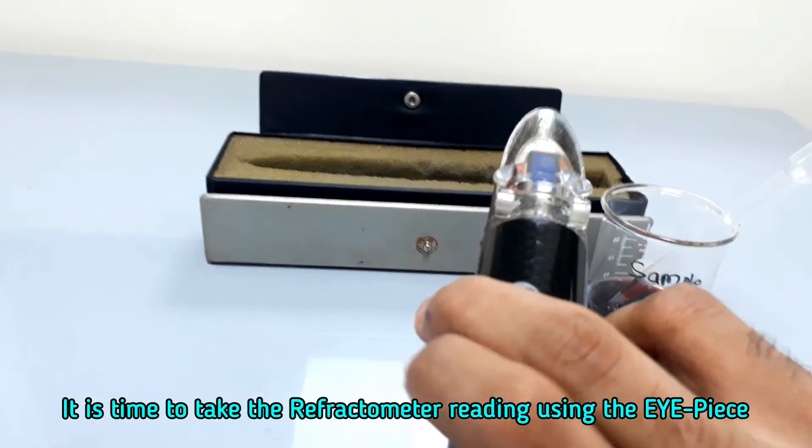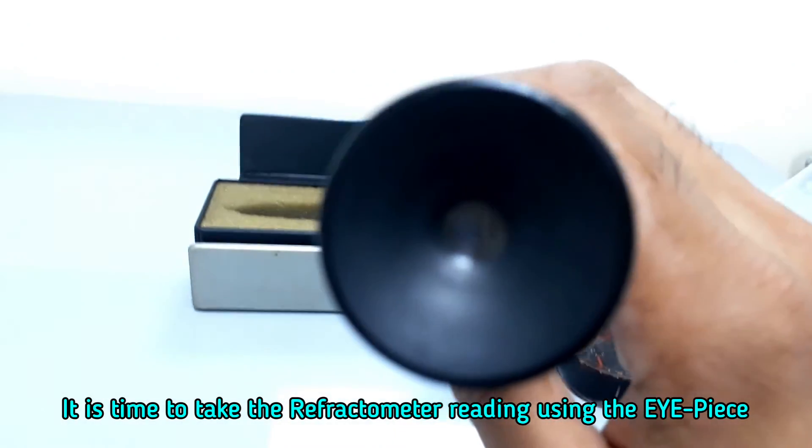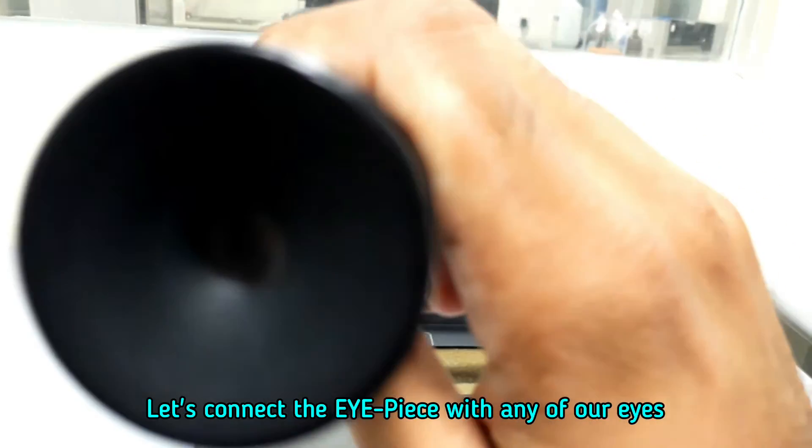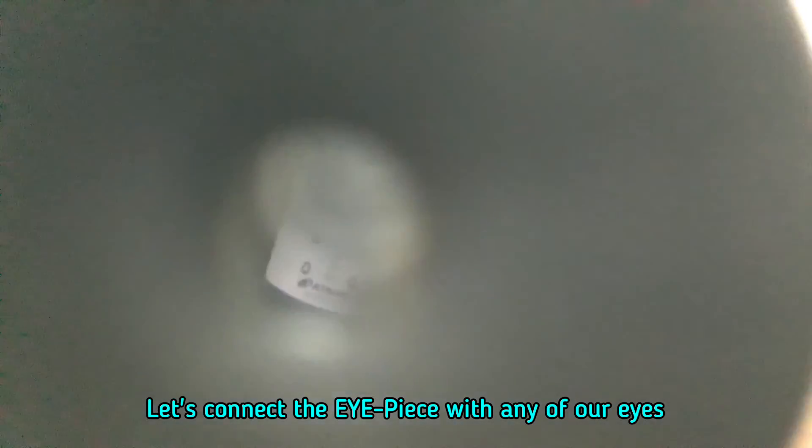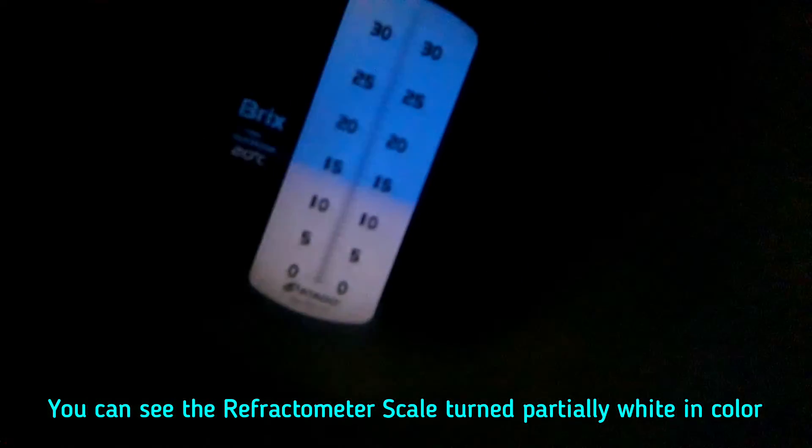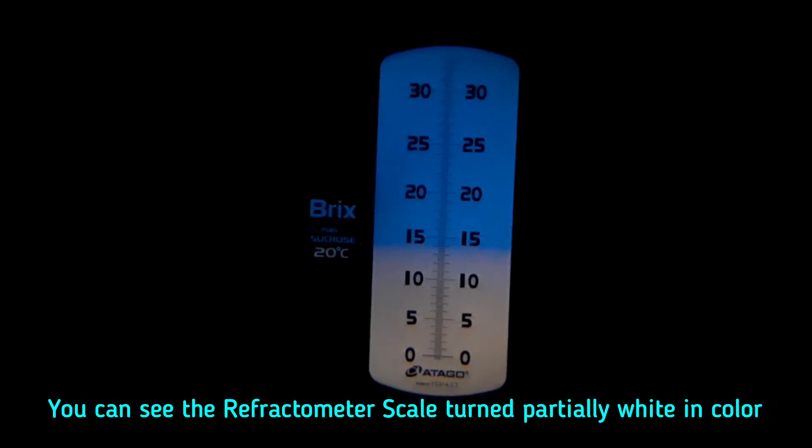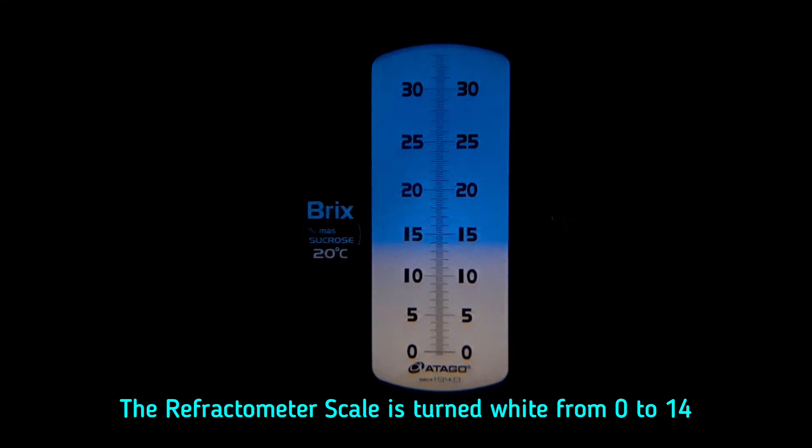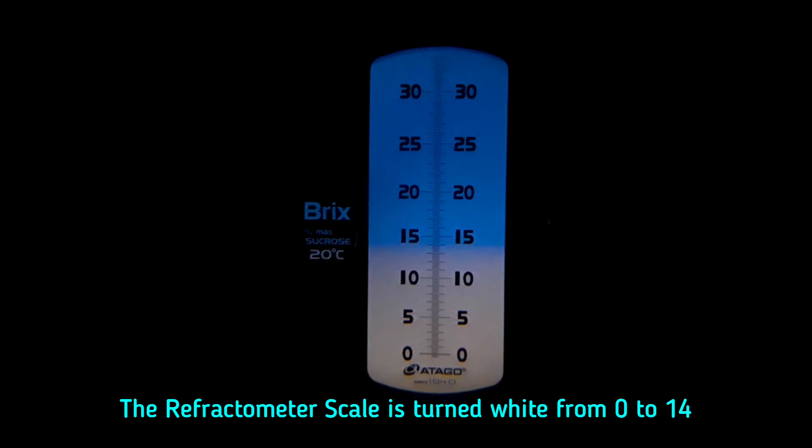It is time to take the refractometer reading using the eyepiece. You can see the refractometer scale turned partially white in color. The refractometer scale is turned white from 0 to 14.